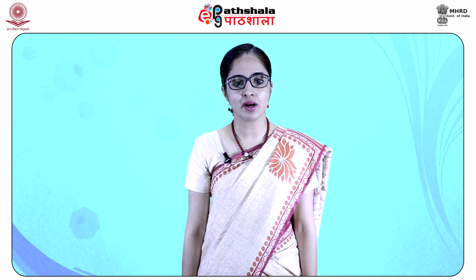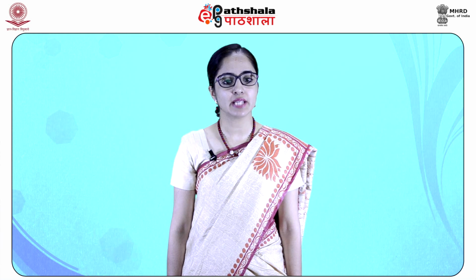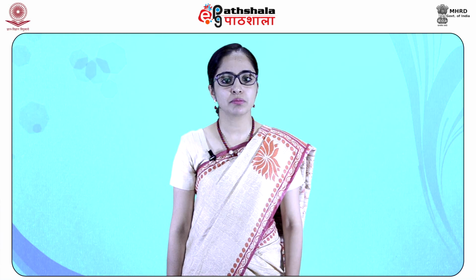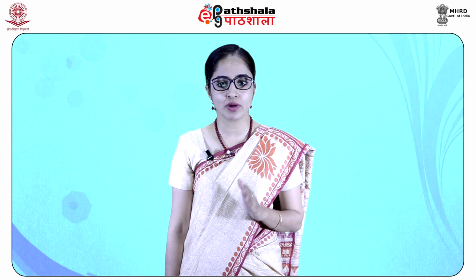For recording NMR, we should use a high quality NMR tube. The diameter of the sample tube should be the same as the coil diameter of the NMR probe in the magnet. We should not use a 5 mm NMR tube in a 10 mm probe unless we have no choice. Bad quality NMR tubes contain regions where the tube wall thickness varies, and this variation makes our sample difficult to shim well.